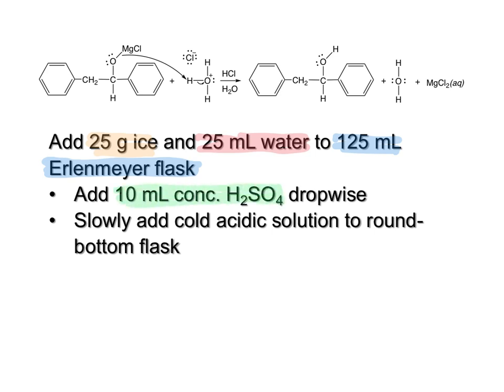Now remember, sulfuric acid is a strong acid, so a couple of points. First, we always add acid to water.